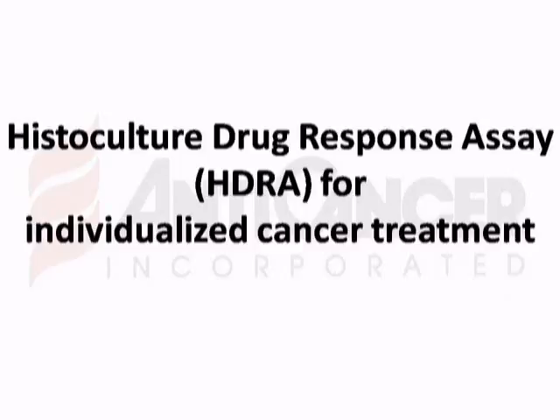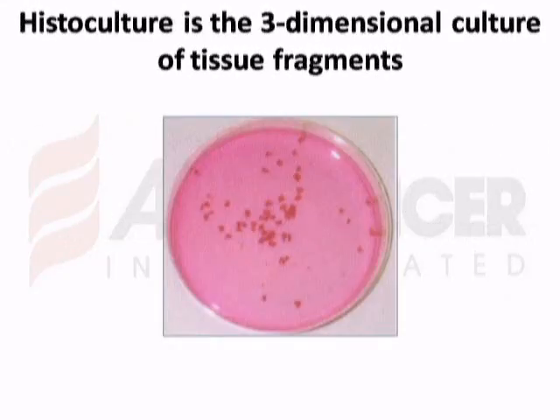The Histoculture Drug Response Assay for Individualized Cancer Treatment. Histoculture is the three-dimensional culture of tissue fragments on a special sponge derived from pigskin. The sponge is called gel foam. The gel foam is soaked in culture medium to allow the tissues to grow.